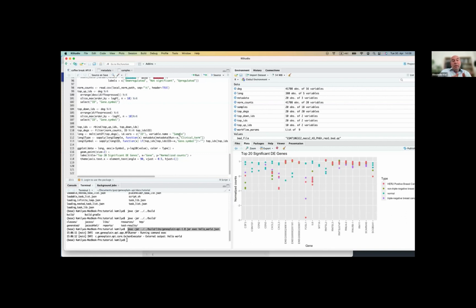You showed how to extend it, for instance to make a new visualization of data which we don't have in the platform, but which is present in Bioconductor and other libraries. You extend the possibilities of the platform with these R scripts or other tools. That's clear, but my question is, how does it work the other way around?